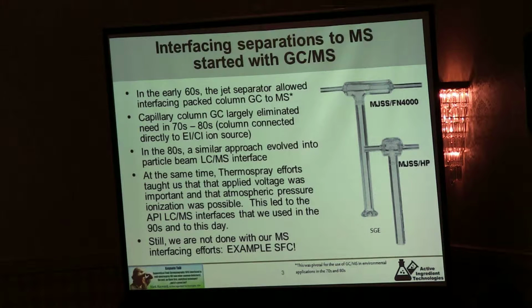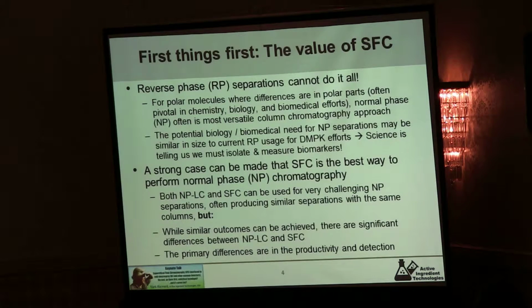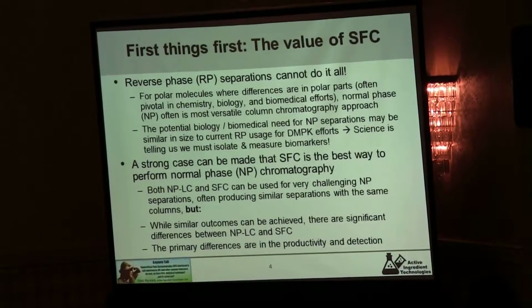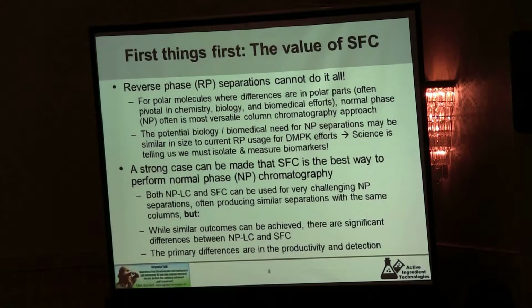It's gotten a little better. There's often multiple stages of this and various ways to help the transport. But things have evolved, but they're not as different as you might imagine. So let's first talk about SFC. Why do SFC? Why not do conventional GC or HPLC?